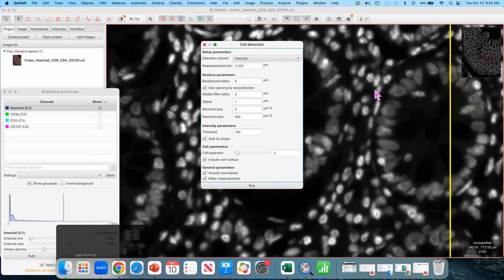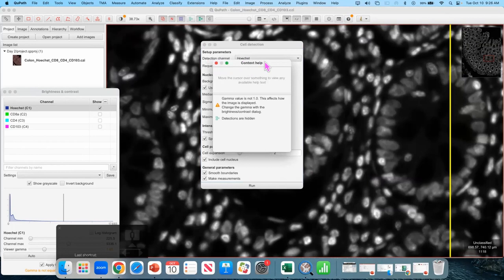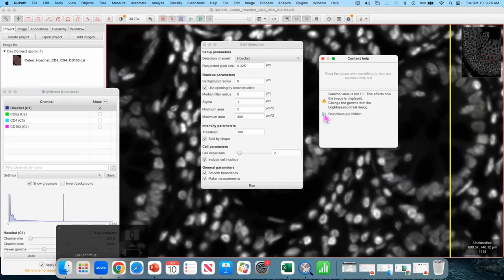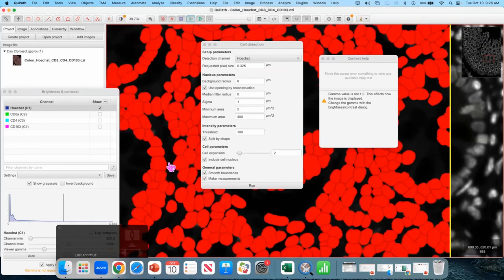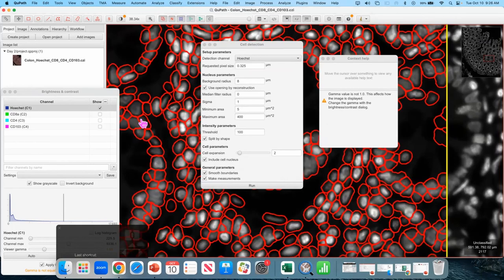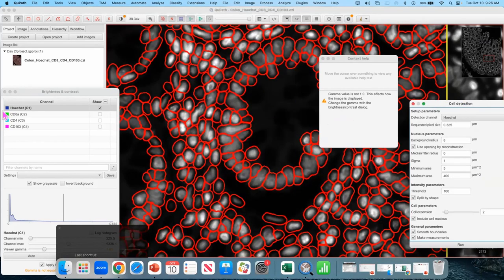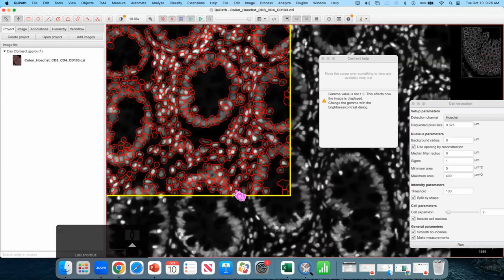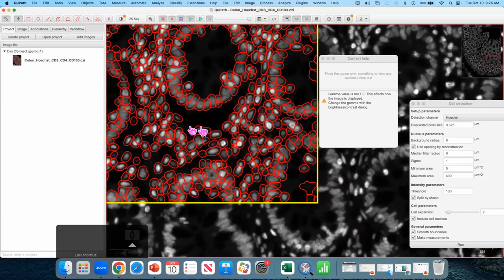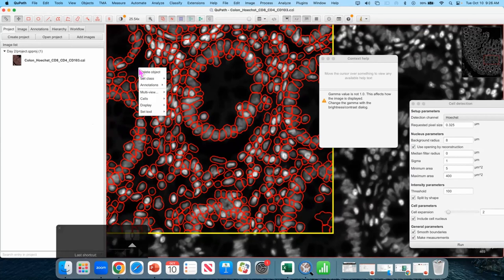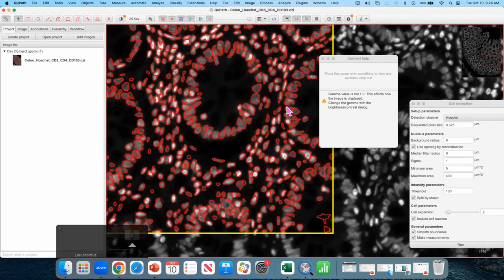Right, I ran this. I don't see any cells. That's okay. This little whole menu has a warning telling me something's going on and in this particular case the thing that's going on that I need to know is that detections are hidden and so we should press this button right here. Cells. They're filled in right now you could press F to unfill them all.